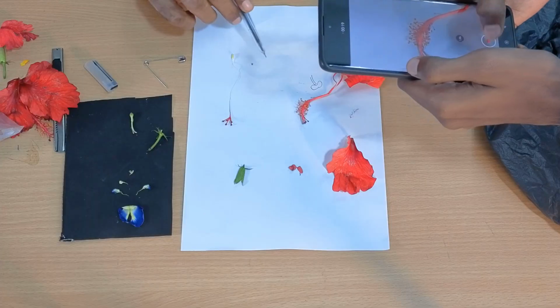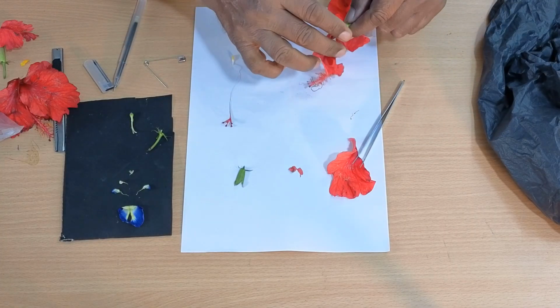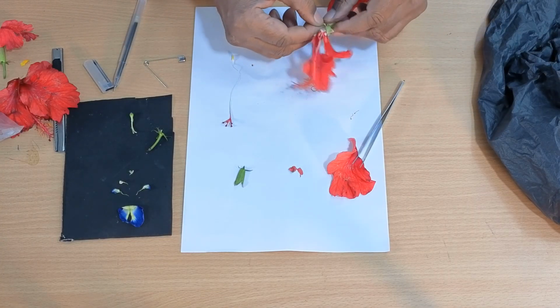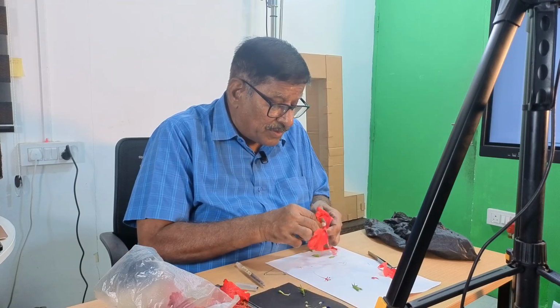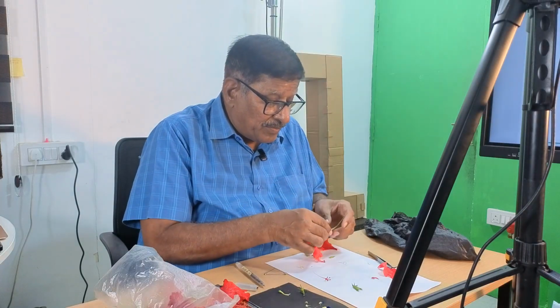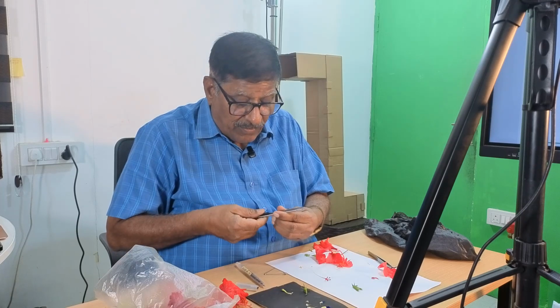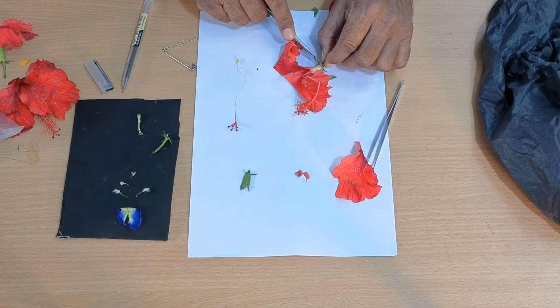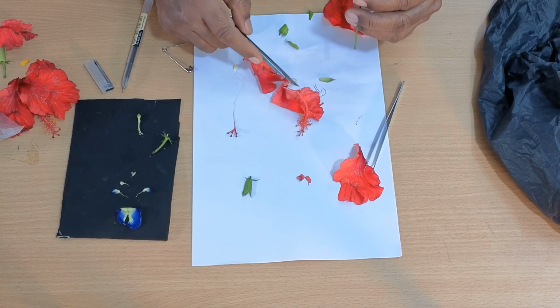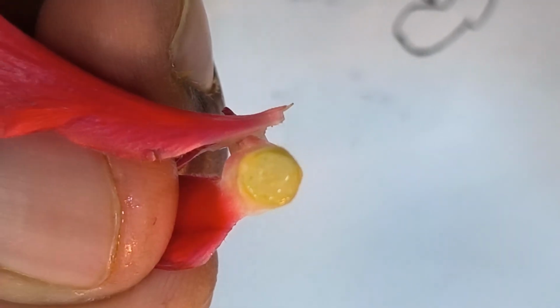Okay, fine. Now let me take you to the world of the gynoecium. The gynoecium, as you know, is highly mucilaginous, and stellate hairs are present on all the parts of the structure. Let me make a section of this. Since this is highly mucilaginous, yes, you can see chamber-like structures here.